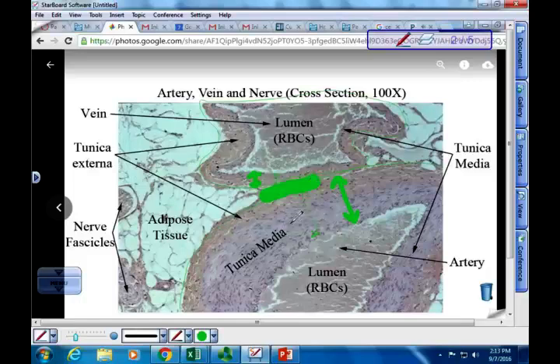Now the artery, because of that thick wall, would tend to be open, whereas the vein might be partially collapsed like you see here. It may be almost sandwiched, like you only see it open on either end and it's totally flattened in the middle. In either case, remember we talked about in lecture how each of these is an organ because they are made up of more than one tissue type. Each of these organs is a hollow organ, so they have an open space on the inside, which is called the lumen.